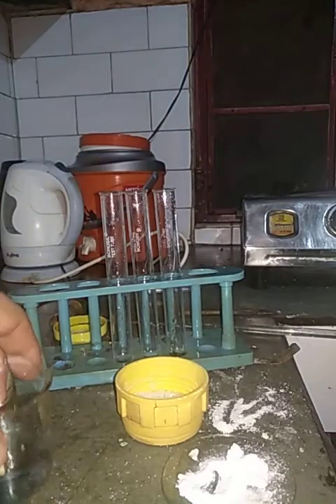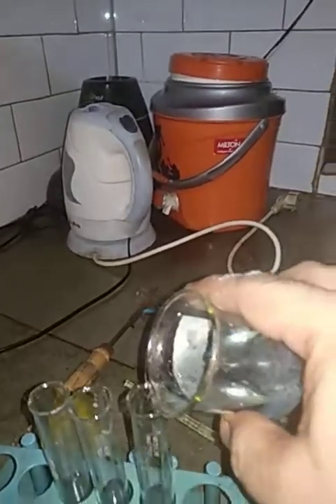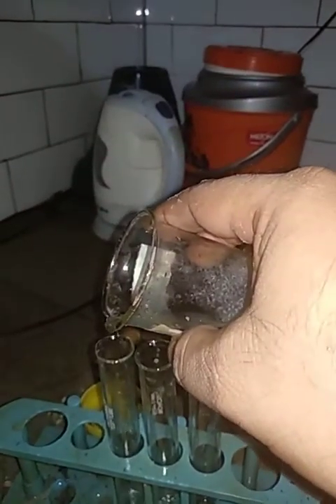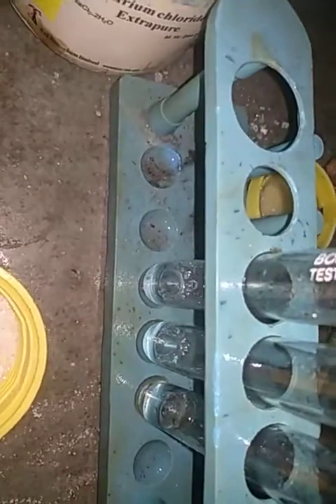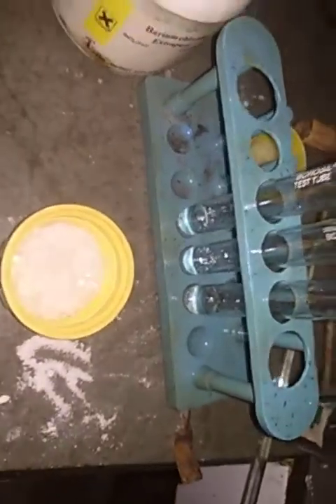Then I am going to add kerosene in these test tubes. So now we can see that the kerosene is present in these test tubes, and now we are going to add these substances into it.